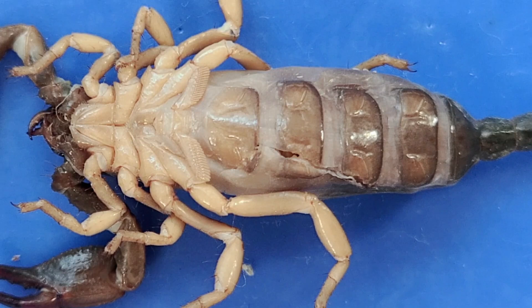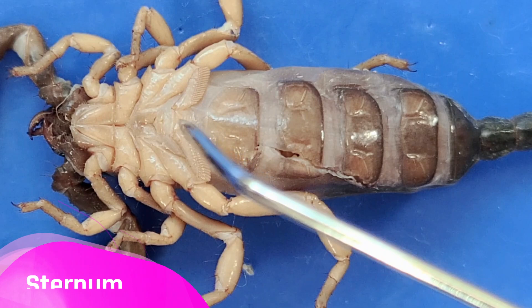Before the scorpion actually eats the food, the mid-gut produces enzymes that flood onto the food. Breakdown of the food begins before the scorpion actually eats it. Then the scorpion sucks the liquefied food into the gut. Now this plate in the middle here is called the sternum.